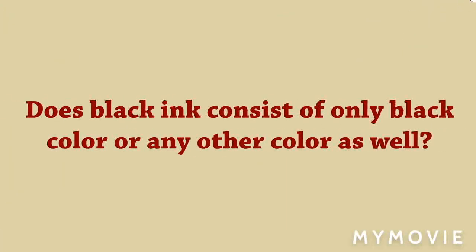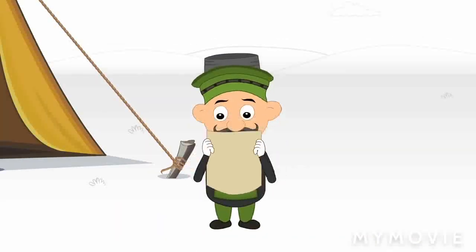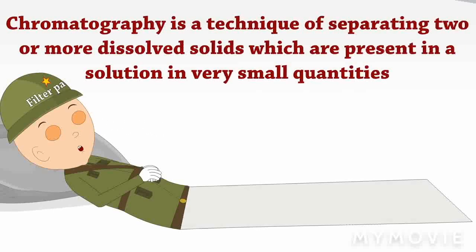Does black ink consist of only black color or any other color as well? Let us find out by the process of paper chromatography. Chromatography is a technique of separating two or more dissolved solids, which are present in a solution in very small quantities.